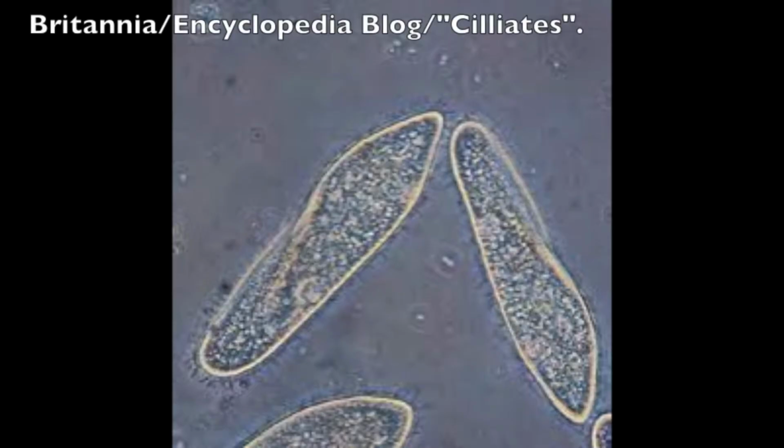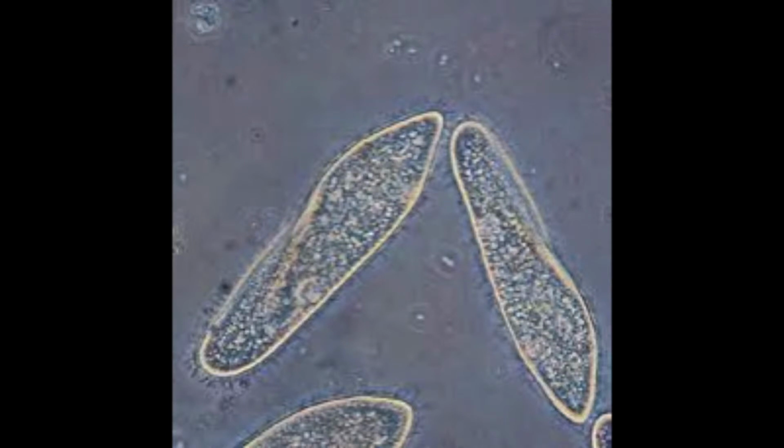As a guide to begin our experiment, we had been given the most frequent elements we can find in these samples. The first one, named ciliates, is a single cell that can be found around as free swimmers and is usually covered with hair-like projections.